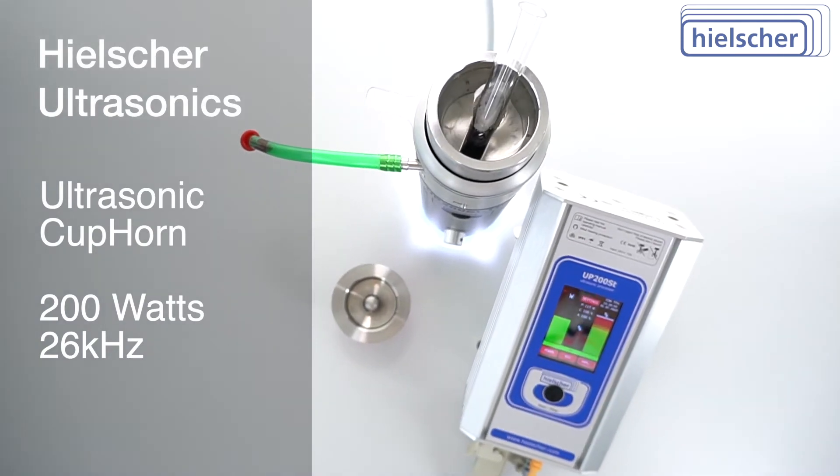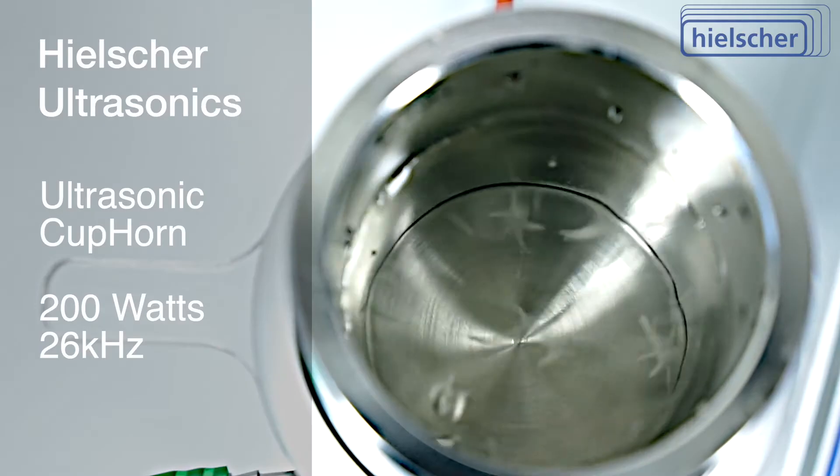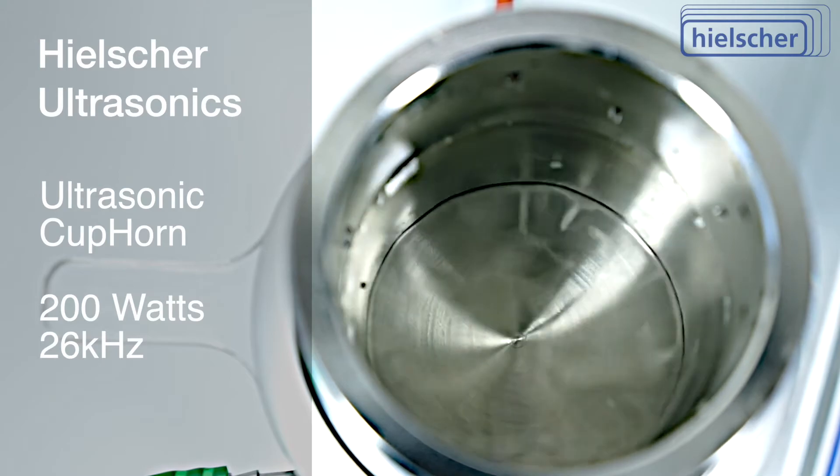The Hielscher Ultrasonic Cup Horn is the world's most advanced ultrasonic cup horn. The ultrasonic intensity of the Hielscher Cup Horn exceeds conventional ultrasonic baths by a thousand times.